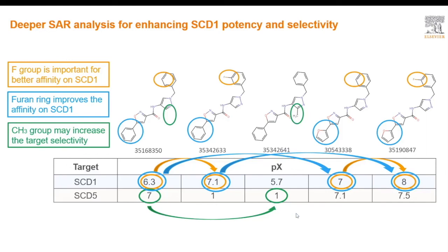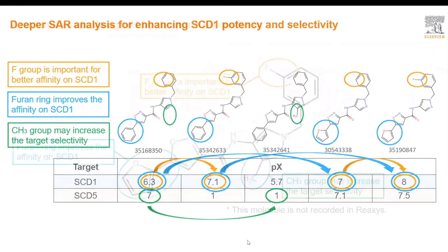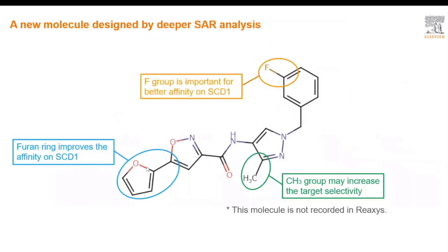The cumulative effect of the analysis of these compounds allows us to design a novel compound that is not in REACSIS, that contains the fluorine, methyl, and furan ring groups, which should allow us to design a molecule which has high levels of SCD1 activity and high levels of selectivity against SCD5.